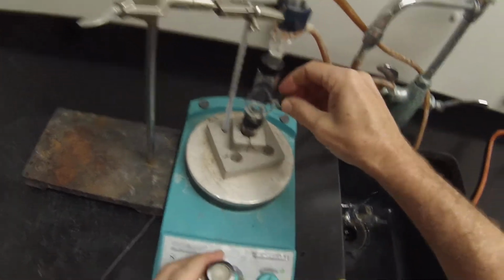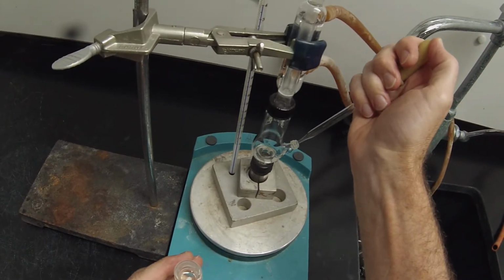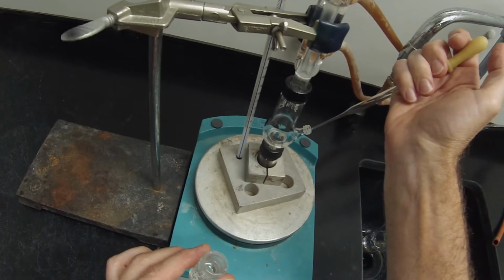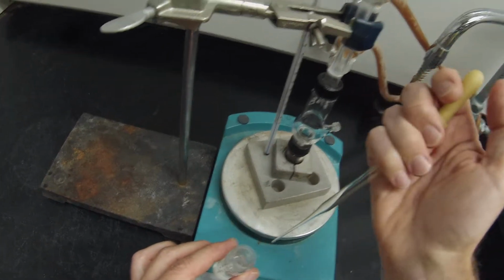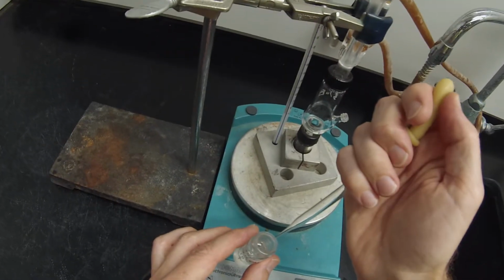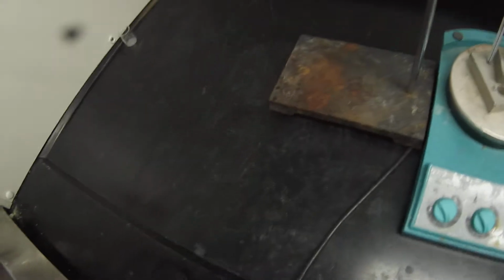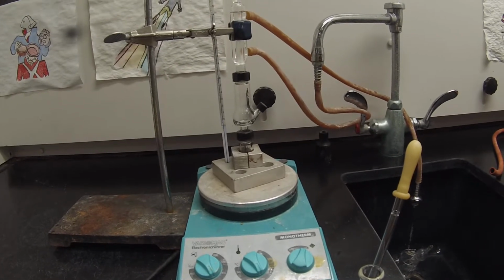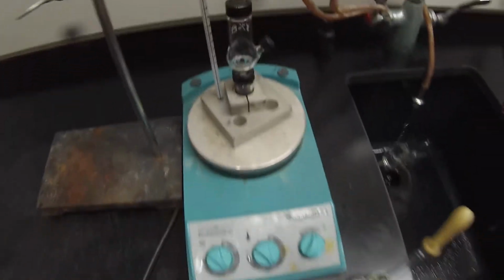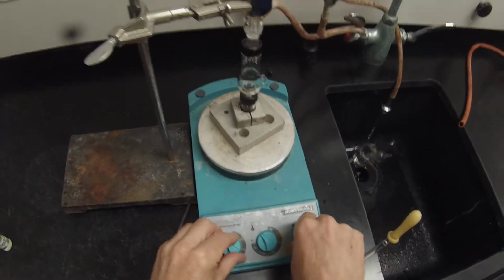and grab that little bit that's in there. Definitely slowed down though, there's not that much coming out now. I think I'm going to call that done. Put our thermometer away. And we will turn our heating and stirring, turn off our hot plate.